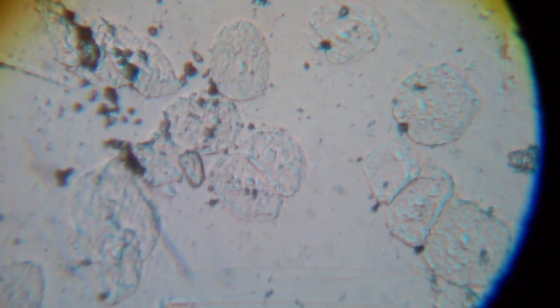So as you can see, the magnification level is good enough. It's up to 240 times, and in the first prototype it was around 140 or something like that.